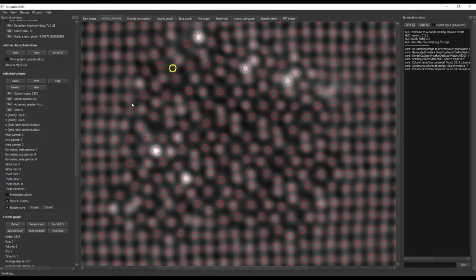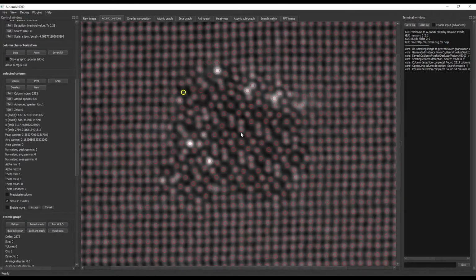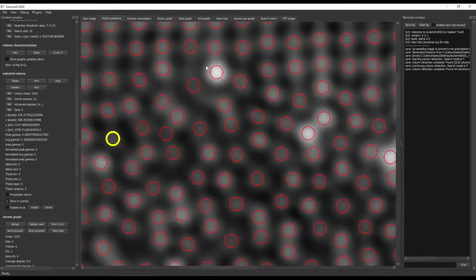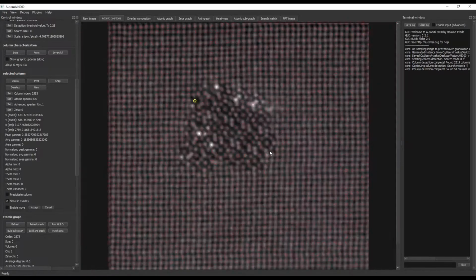I don't remember the keys right now, but an overview of all the keys can be found on the web page for later. So that is our columns. Seems good. And you might have cases where it's a bit ambiguous, and that's up to you what you want to do. I think this is the most correct here.